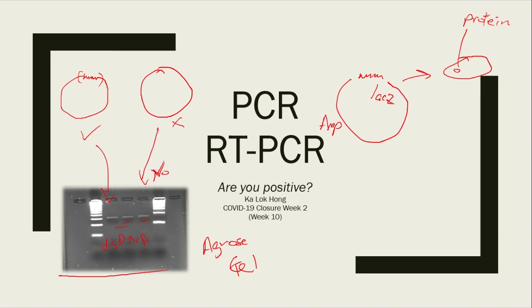So this is a very good way to verify the presence of your inserted genetic material in a plasmid before you start putting it into your organisms and having it produce. If you don't do this verification step, you may end up not having any proteins, so you waste a lot of downstream time. Now, I personally don't do a lot of verifications in my step.